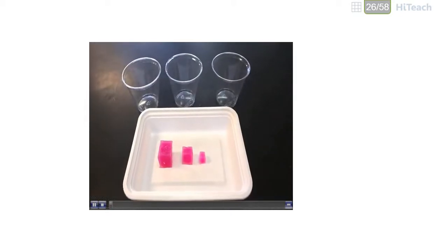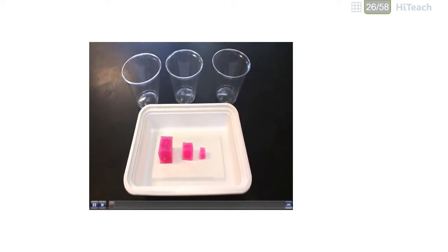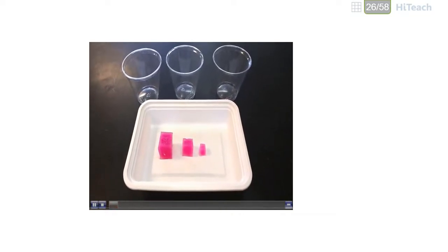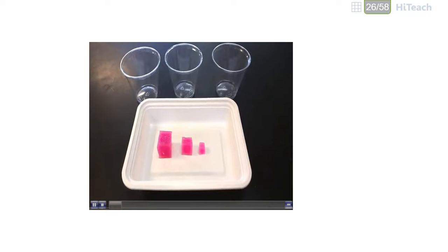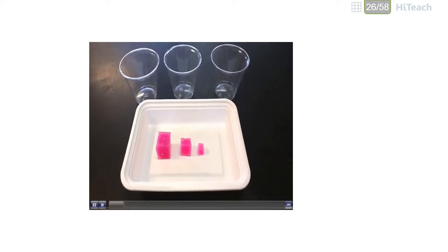A good lab to determine why cells are small and not large is to take cubes made of agar. In them they have phenolphthalein and a little bit of sodium hydroxide. The phenolphthalein is a pH indicator. The sodium hydroxide reacts with the pH indicator and makes the cubes of agar bright red.